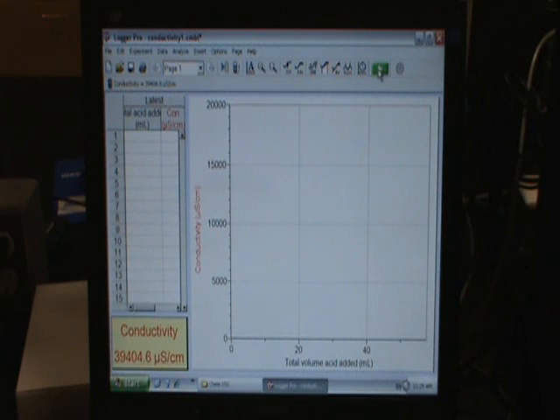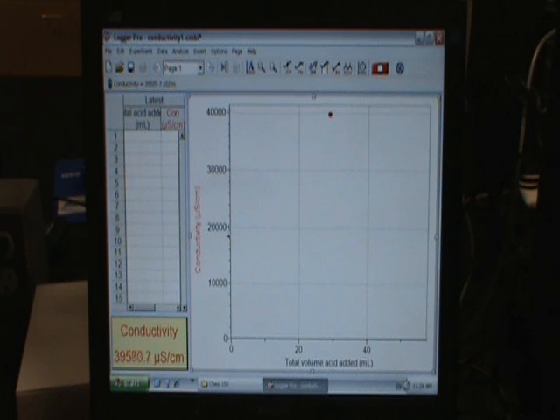So I'm clamped in position. I can go ahead and hit the start collection button up here, and that turns red and nothing else happened. So let's grab there. I just rescaled my axis. You see the cursor change when I point to it. There's what it's reading right now. I've started a collection and I want to keep this point because this is the point where I've added zero milliliters of acid.